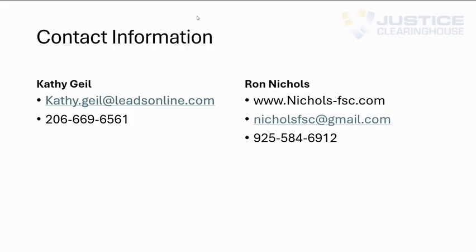Great. And then Caitlin asks, what workflow process would you suggest for VCM with regular light microscopy? Kathy, you want to take that one? Sure, I'd be happy to. So obviously there's lots of different ways you can do that workflow.